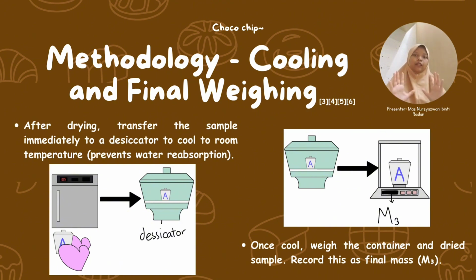We do this easily because we weigh the crucible first before we put the sample in. There are going to be a few arithmetic steps in there, but it's nothing hard. It's simple mathematics. The example values for this calculation will be presented to you in the next slide, the results slide.